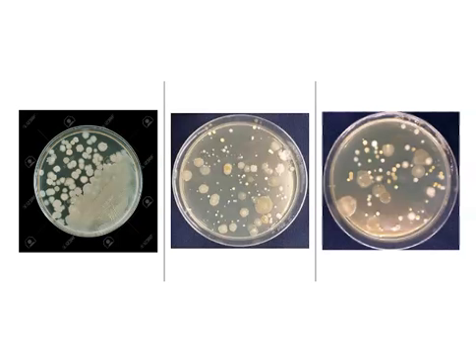On this slide, you're looking at 3 agar plates. These were all taken, or I should say made, using environmental samples. And part of why I show them here, again, is to drive home this idea that most samples that are taken from the environment, whether we're monitoring a body of water or we're monitoring a hospital cleanliness program, most environmental samples are going to be mixed.